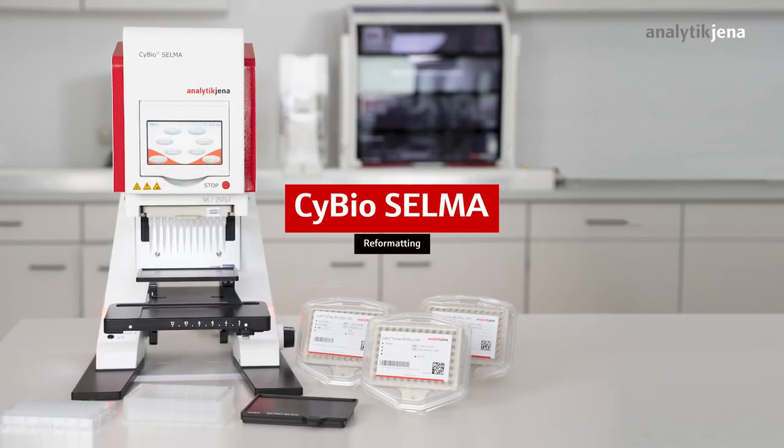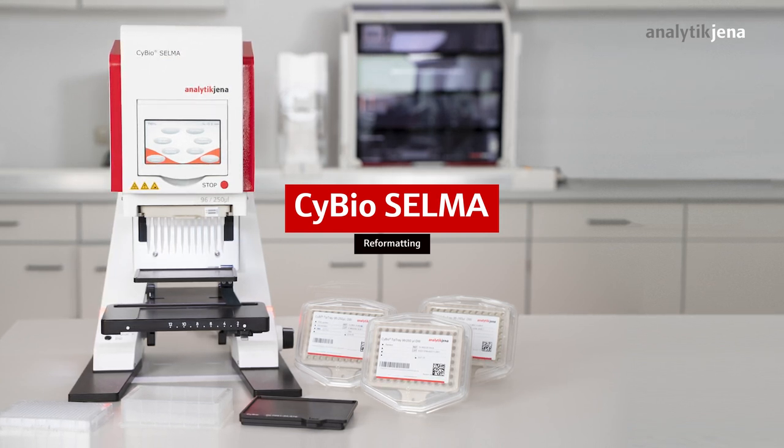Saibio Selma is a semi-automatic pipetting station that can be placed space-saving onto a lab bench due to its compact footprint and design.